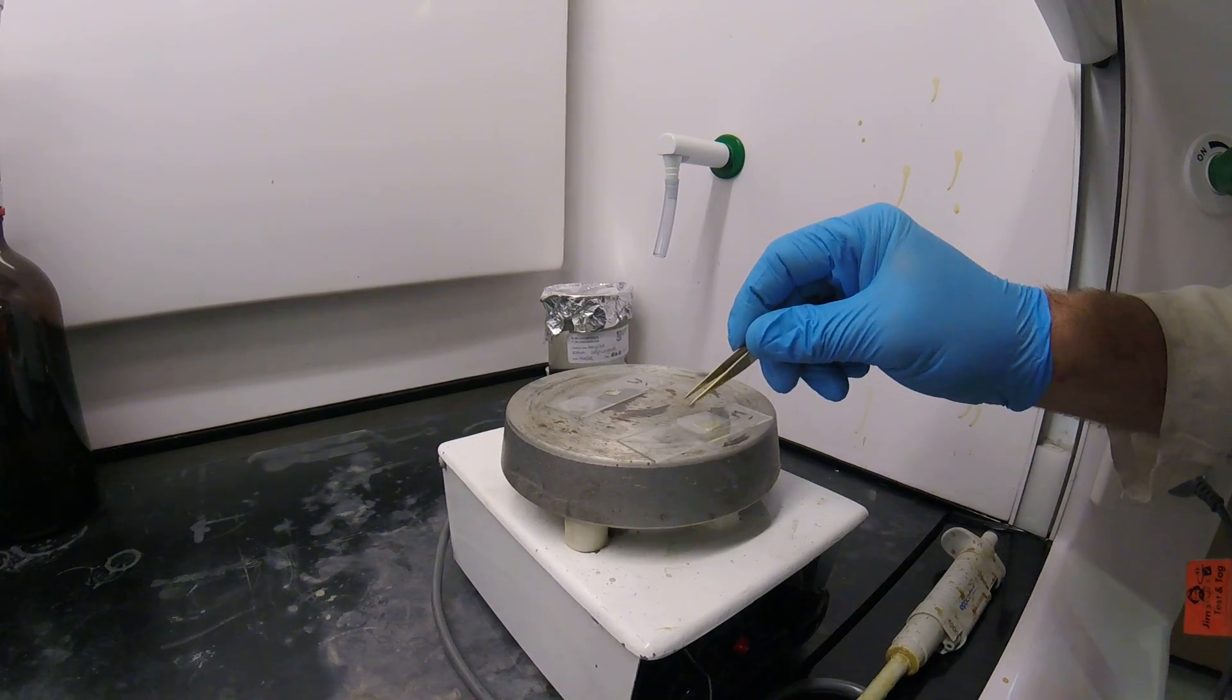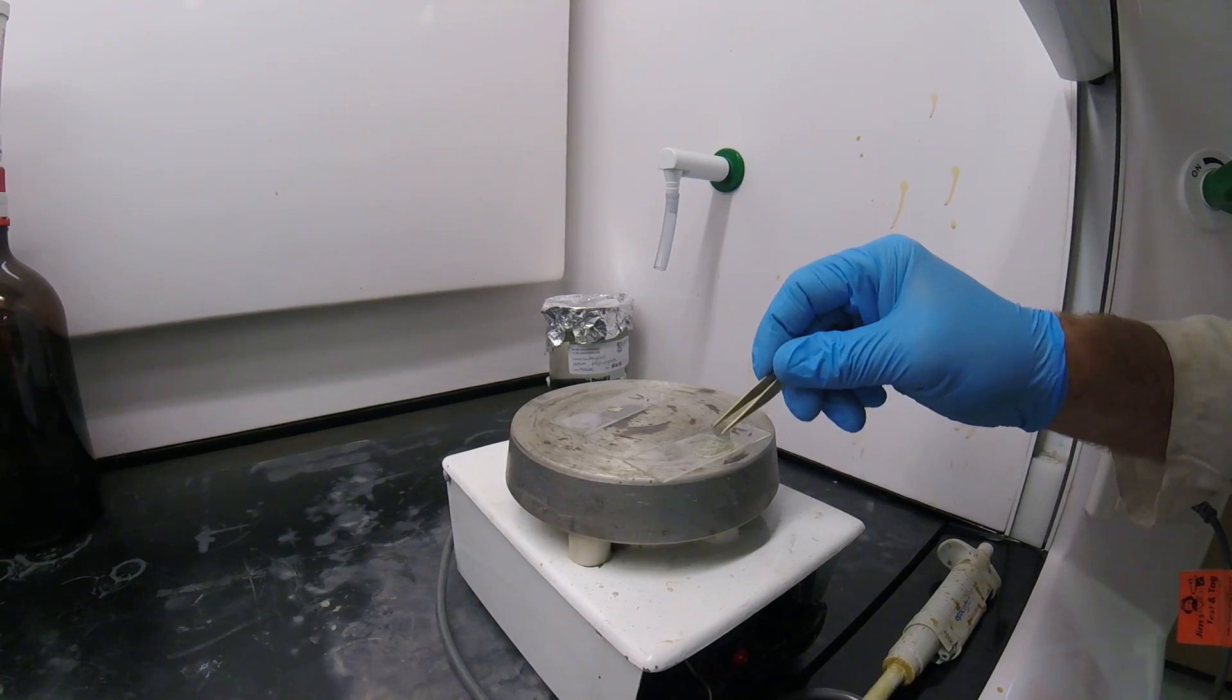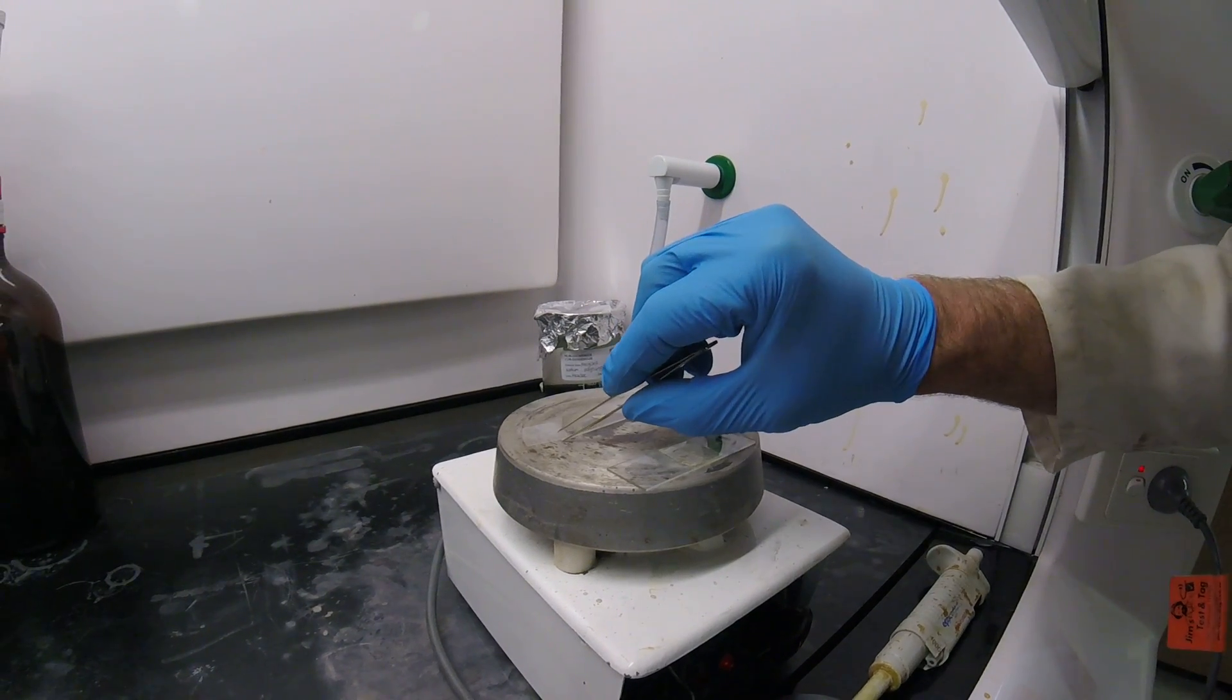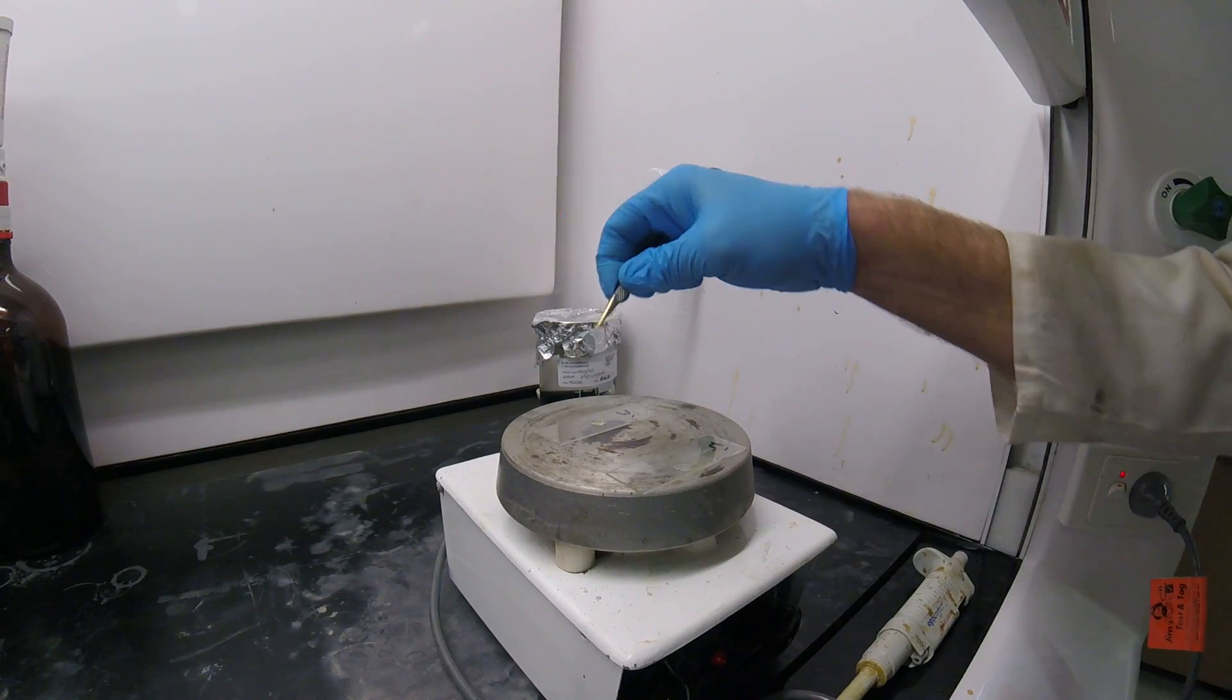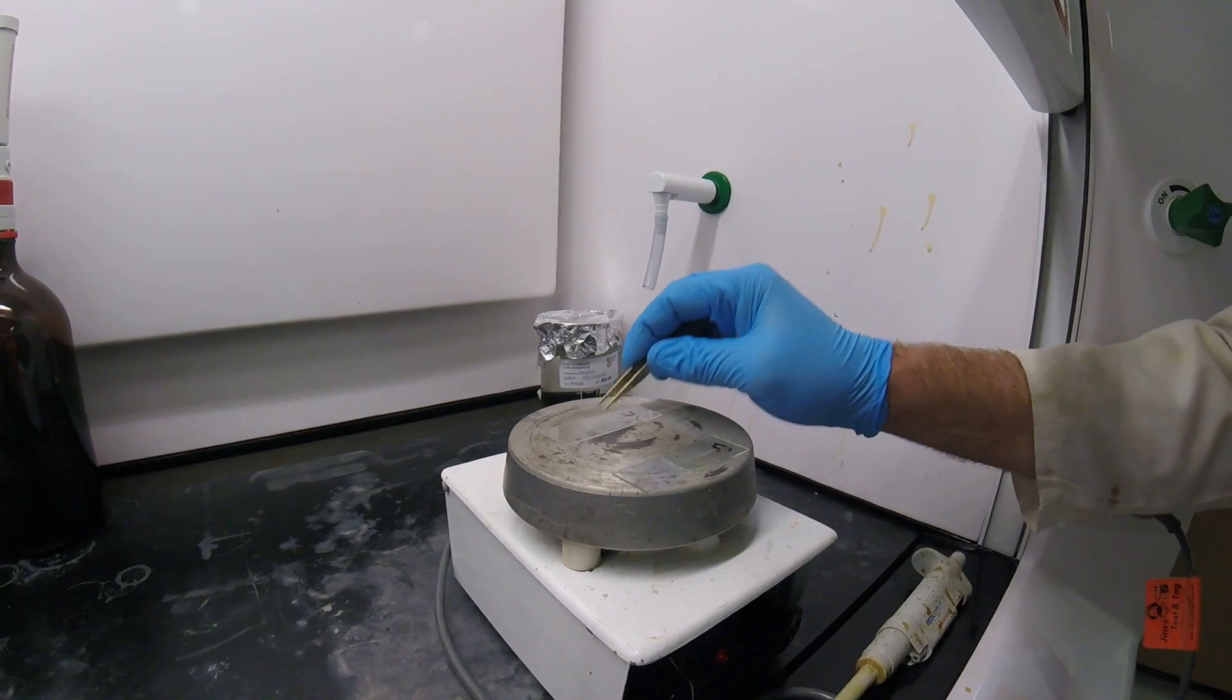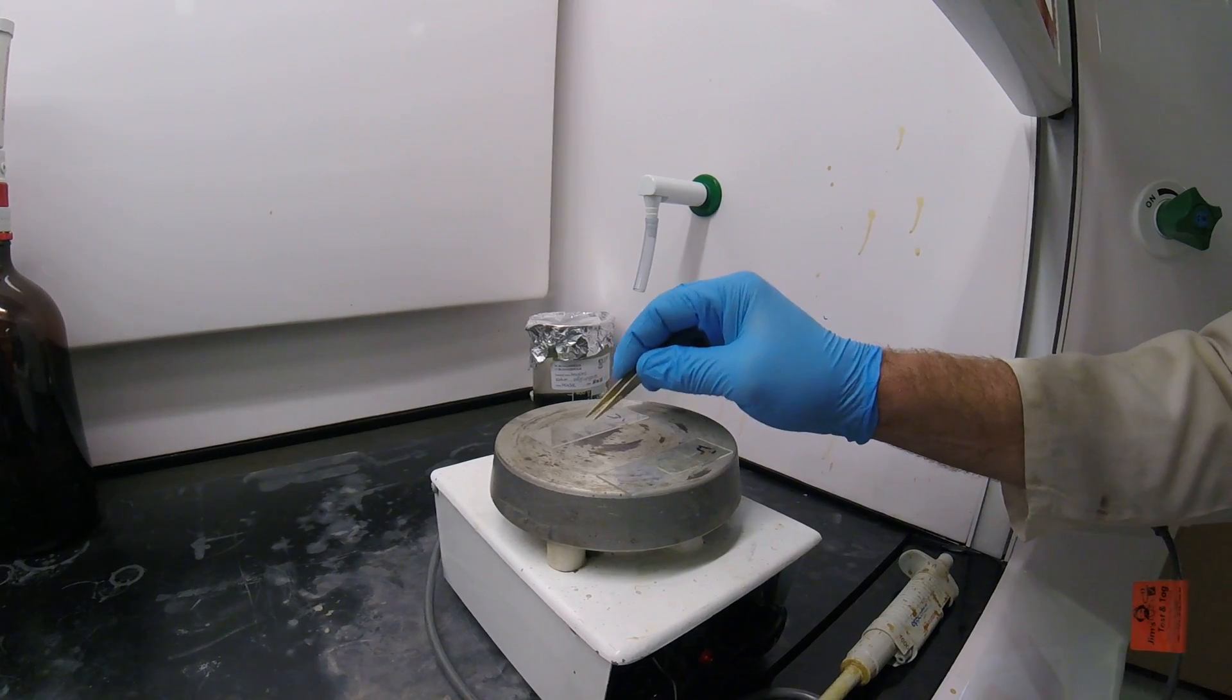And then we can see the toluene start to bubble off here and we'll just leave that sit there for a minute. Then we'll press this down and push all the bubbles out. And importantly we'll push the cover slip down as hard as we can so that the diatom valves get pushed down and as much as possible get oriented in valve view so that they're easily identifiable rather than being on their side in girdle view.